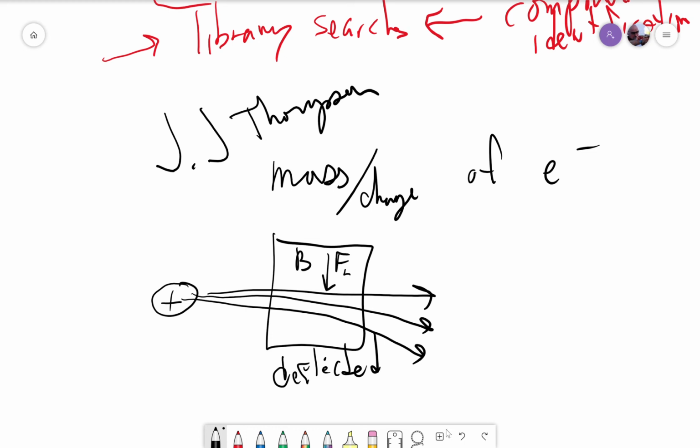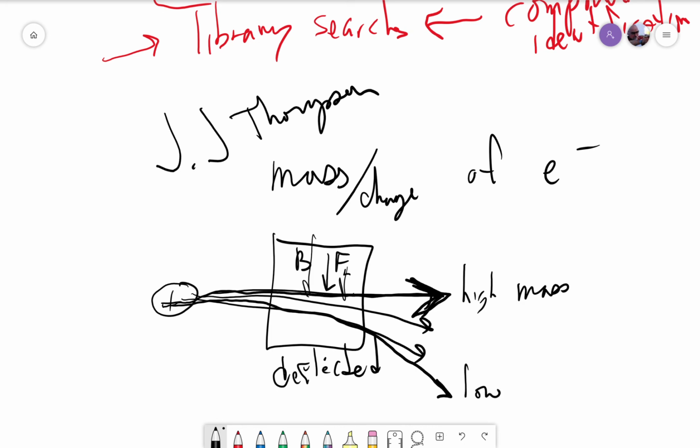Consider that if you have a very heavy basketball or medicine ball being thrown in one direction with a breeze blowing perpendicular to it, the angle of deflection would be very little. If you have a light molecule with low momentum, that same crosswind could blow it to a higher amount of deflection.